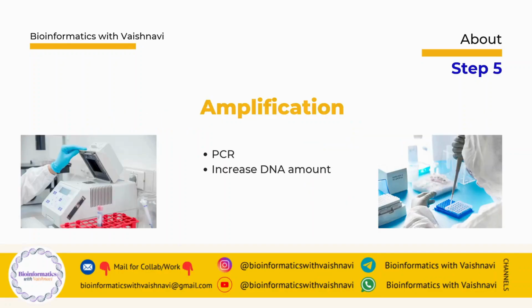The next step is amplification. In many NGS workflows, the DNA is amplified. This is usually done using PCR. Amplification helps to increase the amount of target DNA and ensure sufficient material for sequencing. Generally, not all workflows need amplification, but many common NGS protocols do.